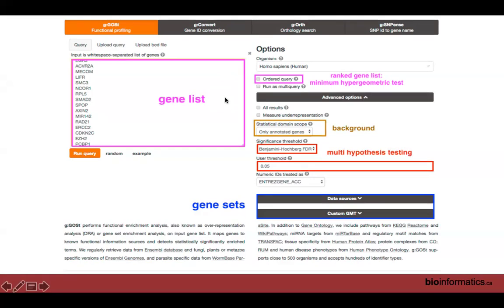If there's something in there that it doesn't recognize, it will come up and tell you, listen, we found multiple mappings for this gene. Which one do you think is the best one to use? That actually often happens when you do a search with gProfiler. So you just have to look at the ones that it's giving you, and often it will be relating to Ensembl annotations. And what I often do is select the one that has the most annotations, because there could be multiple mappings for a given gene.